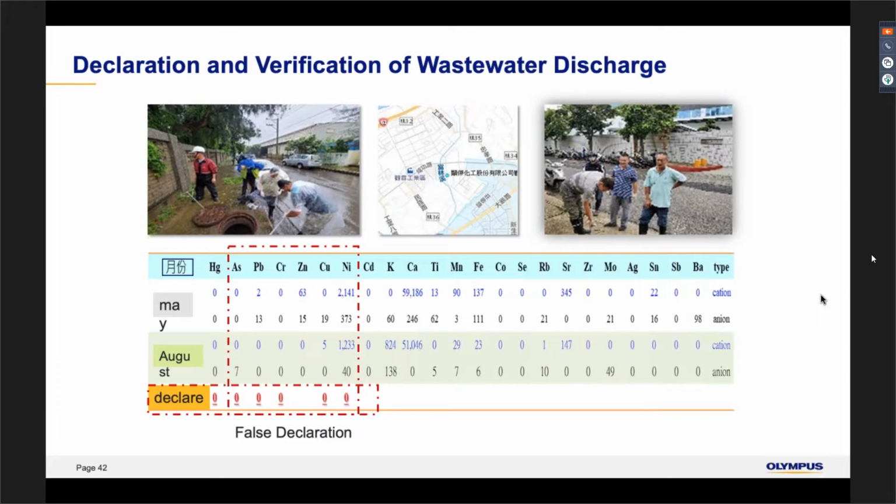Okay. Can you explain the disadvantage that XRF is less suitable for liquid analysis? I mean, if we use a low-end portable XRF, it's less suitable for liquid samples.